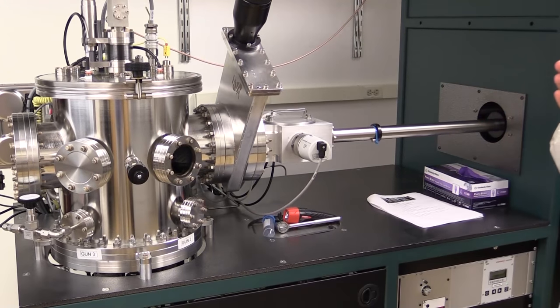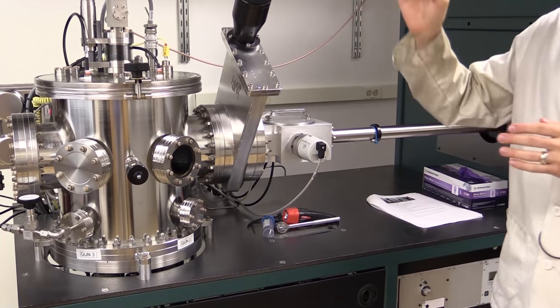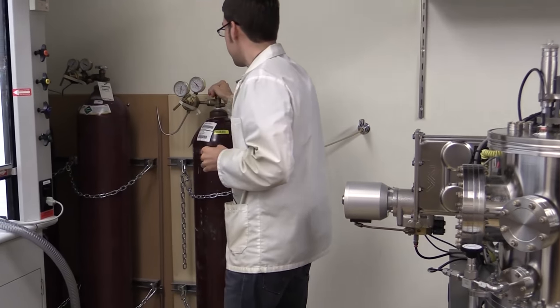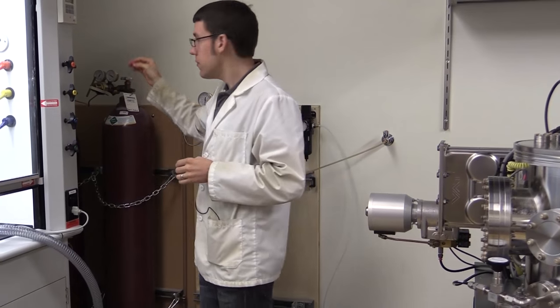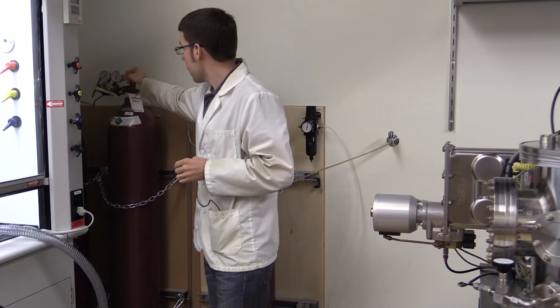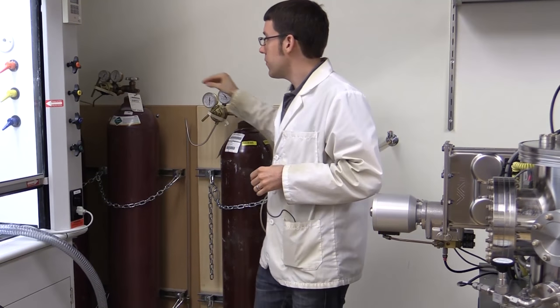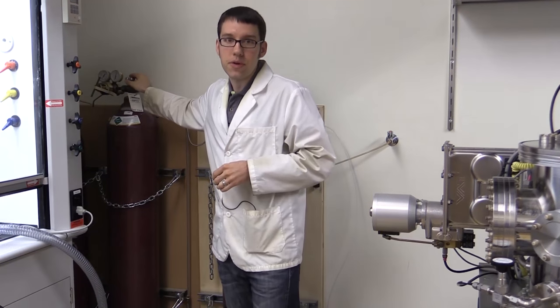So back to our sputtering process. I need to open some valves on these tanks. I'm going to open an argon valve as well as our nitrogen valve. Argon is for our process. Nitrogen is for venting when we're finished.